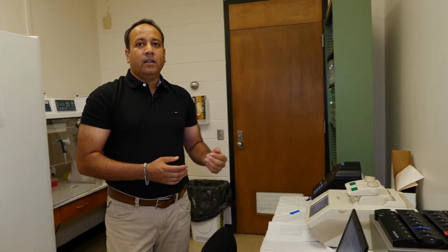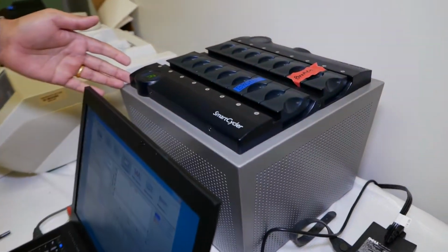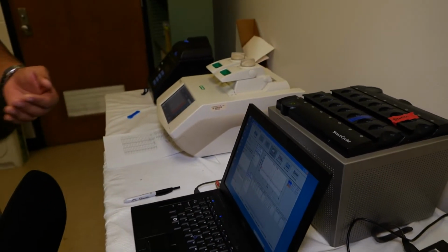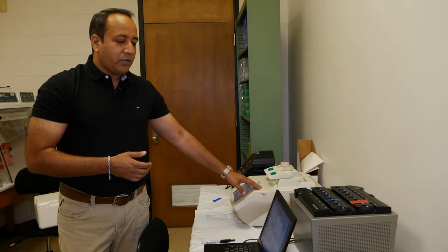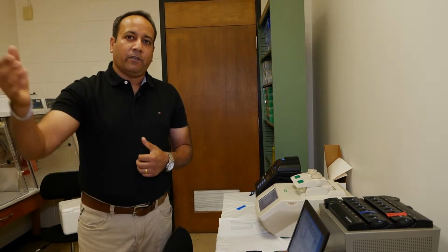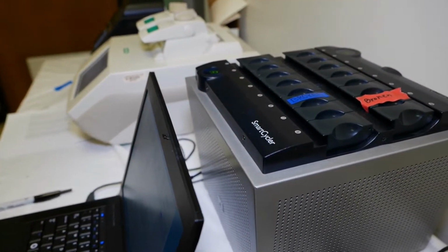This is our PCR room where we run the conventional PCR and the real-time PCR, and this is our real-time PCR machine. The difference between these two is that the real-time PCR is in real time, so you can see the results while the machine is amplifying the DNA. With the conventional, you have to amplify the DNA first, then run the gel documentation system on it and see the results on the gel. In this case, you don't need a gel after you run the PCR.